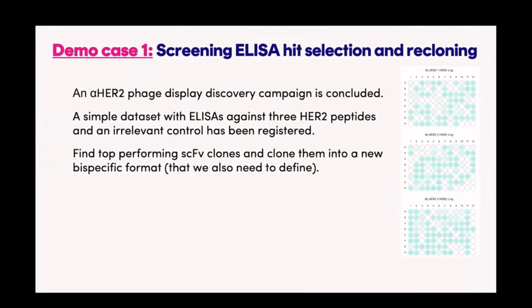All right, I need to move on. But that was that. So we started with a fairly simple ELISA data set, and in these couple of minutes here, we selected the hits. We recloned them into a completely new bispecific antibody format.